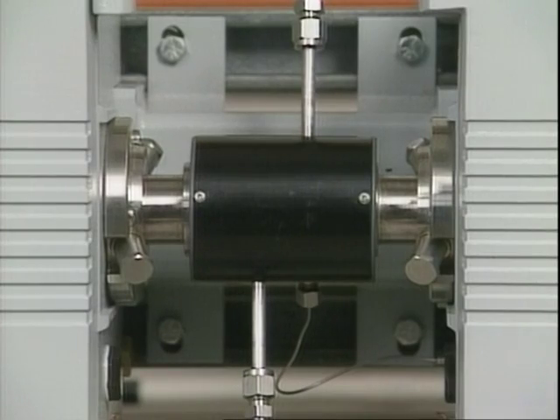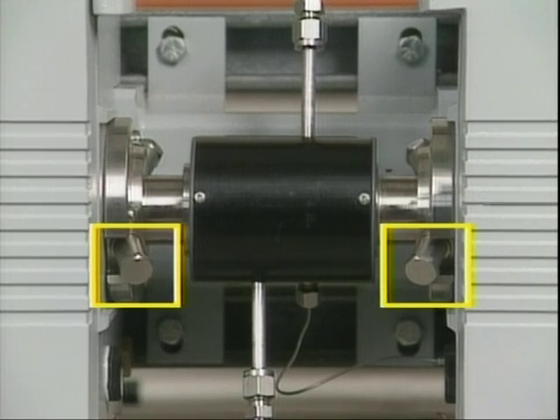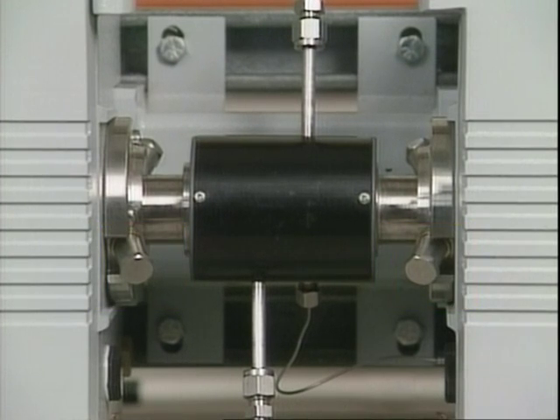Some analyzers, for example CO and CO2 analyzers, have a nitrogen purge to keep ambient air out of the optical path. Other analyzers, like this one, use chemical scrubbers to remove the CO and CO2. If there are purge connections fitted to the flanges, remove them. Try flushing the sample cell before dismantling it for routine cleaning and maintenance. Dismantling the sample cell increases the chances of breaking the sample cell windows and results in longer downtime.